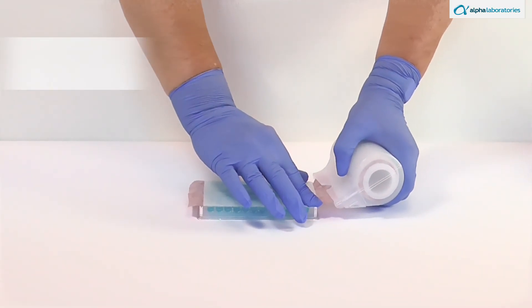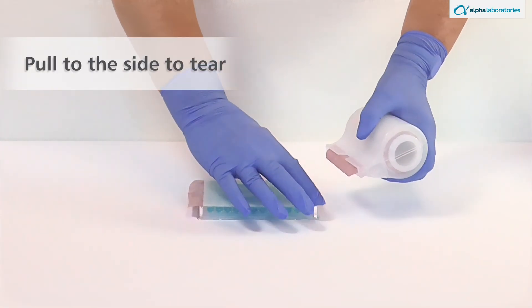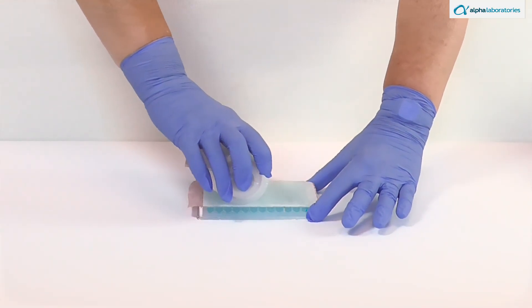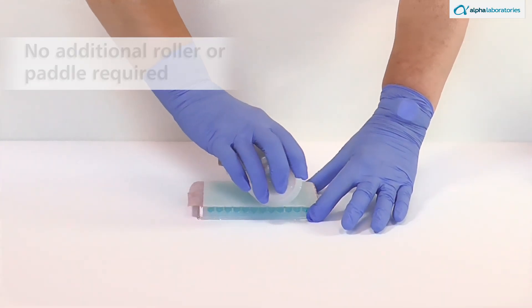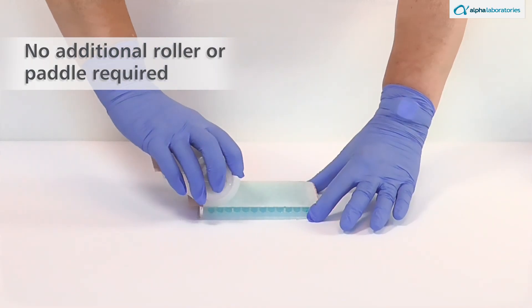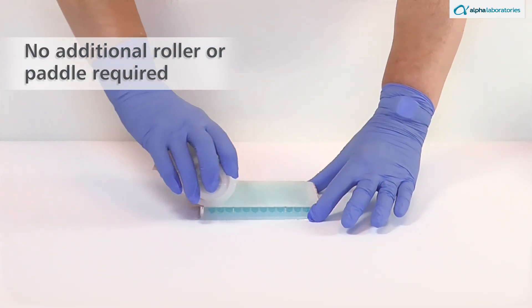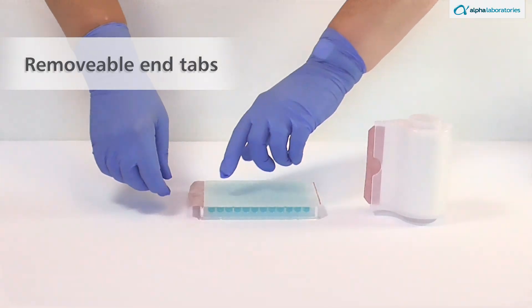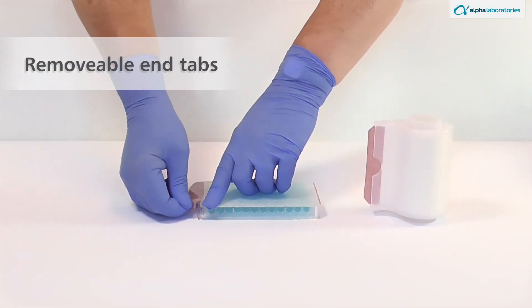To tear along the perforation, pull the seal to the side rather than upward. Once applied, the dispenser's smooth lower surface can then be used to secure the film over all wells, instead of needing an additional roller or paddle. The end tab can be left for labeling purposes or removed at the second perforation, as preferred.